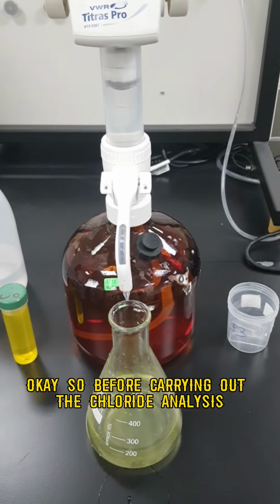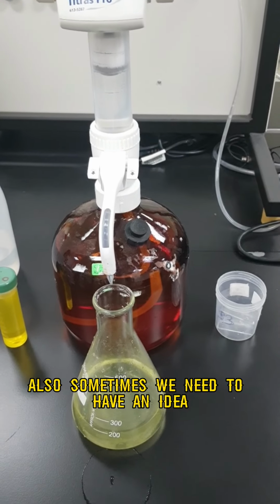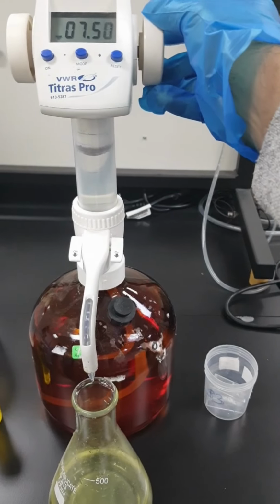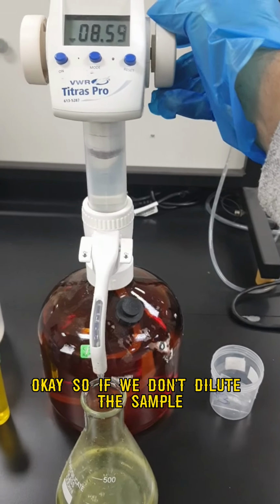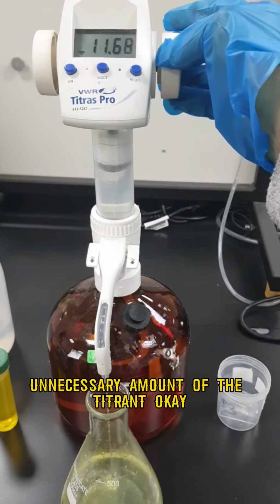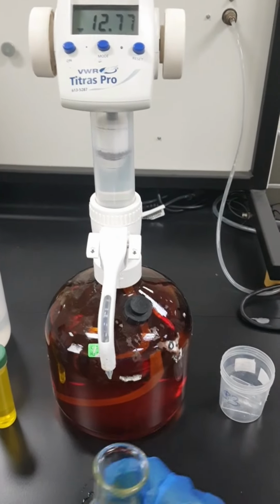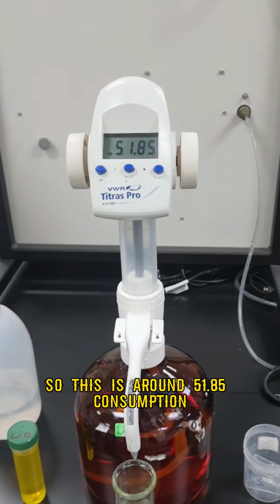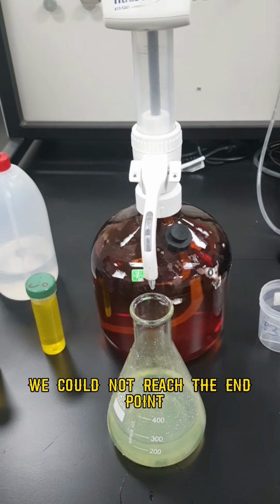Before carrying out the chloride analysis, sometimes we also need to have an idea how much chloride is in the water sample. If we don't dilute the sample, we will consume an unnecessary amount of the titrant. So this is around 51.85 consumption. Still the color has not changed. We could not reach the endpoint.